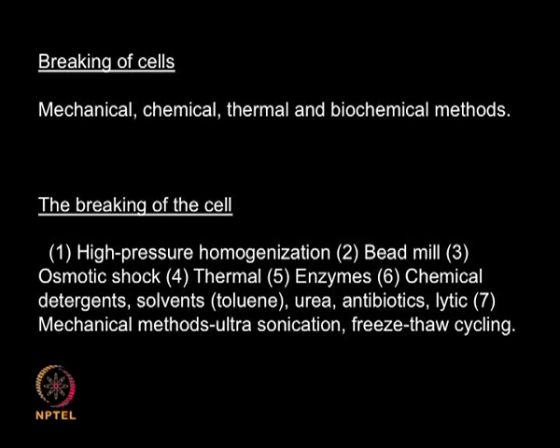So there are many different ways of breaking cells, as I introduced last class. Mechanical methods are there, chemical methods are there, thermal methods are there and biochemical methods are there, and each has advantages, disadvantages, and each can be used for certain types of applications or purposes.